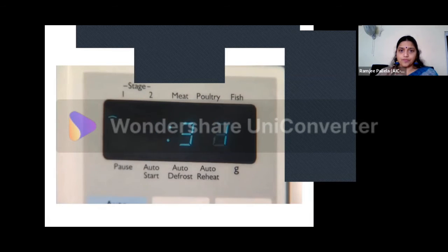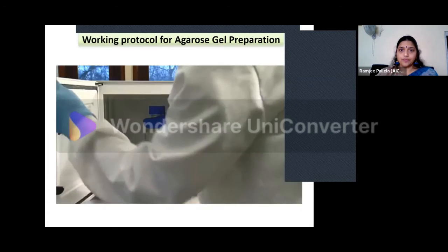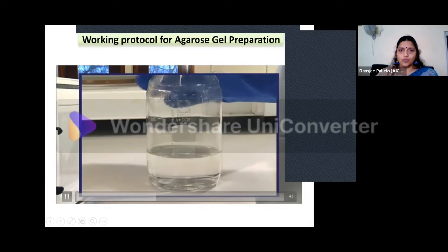You should mix the gel solution at intervals during heating, but be sure you wear safety gloves. The solution can become superheated, and when you mix it, the liquid can suddenly boil up.